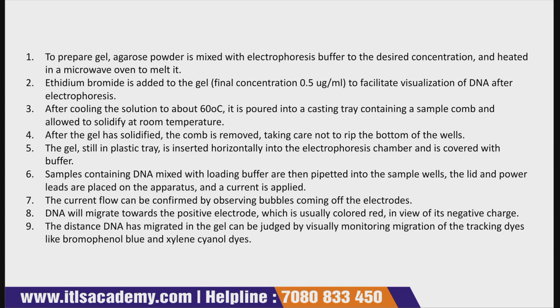And what is the final concentration? The final concentration would be 0.5 micrograms per milliliter, to facilitate visualization of DNA after electrophoresis. Then you keep it for cooling. After cooling, when the solution is about 60 degrees centigrade, it is poured into the casting tray that we have already discussed, a tray composed of UV-transparent plastic material.